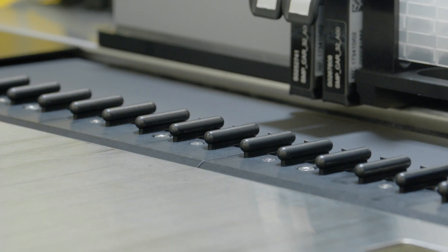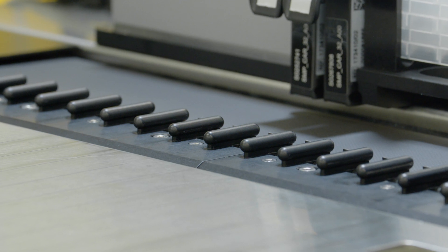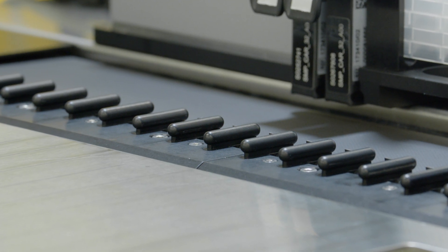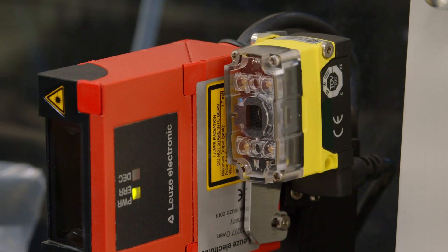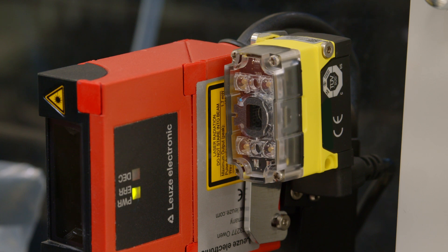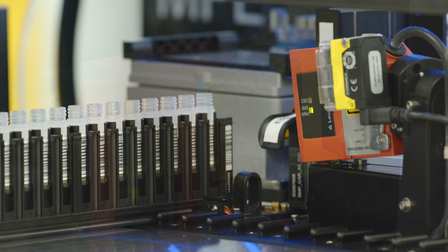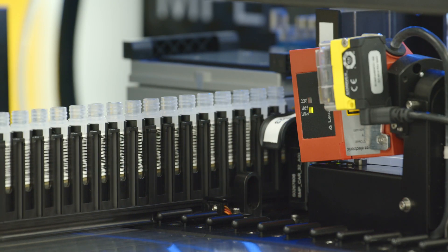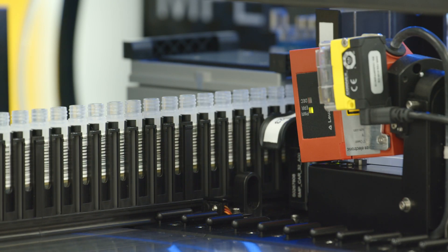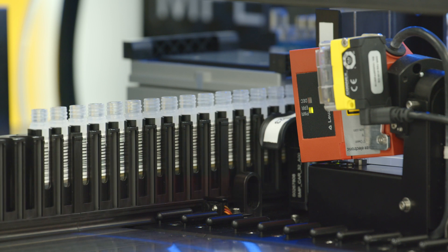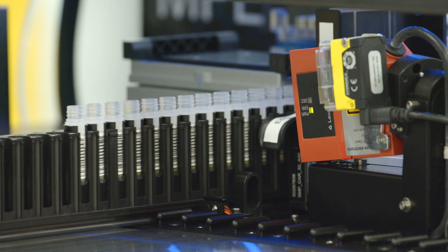Stop hooks secure the carriers when they are on the autoload tray. A barcode reader scans the barcode labels on plates, reservoirs, and tubes prior to running the method to ensure that the work deck is set up properly.